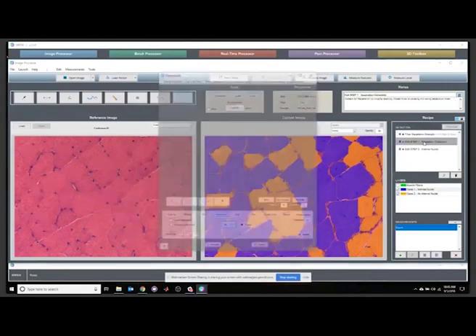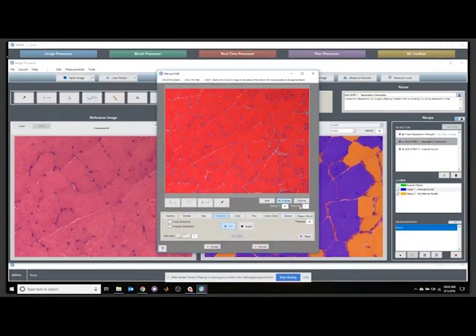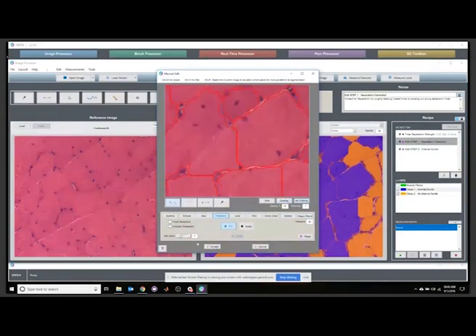So, for example, we can go in here, change this back to outline. We notice that there's a couple of fibers that were not perfectly selected. We're going to go ahead and fix that. So we don't have to be perfect with the segmentation. MIPAR is able to clean this up for you after you're done. We know that this line is not correct. We can just fill this in and cross this line out. We don't have to worry about removing it entirely, and then simply hit accept.